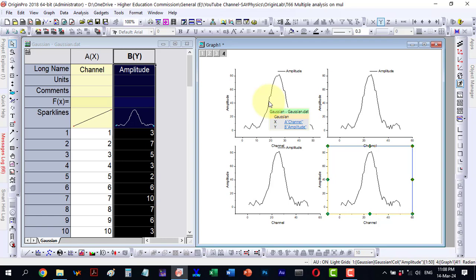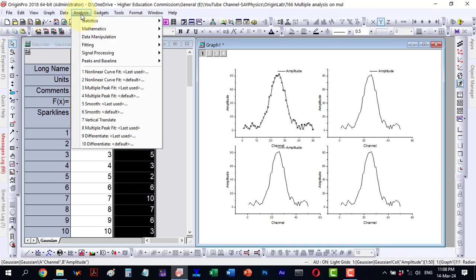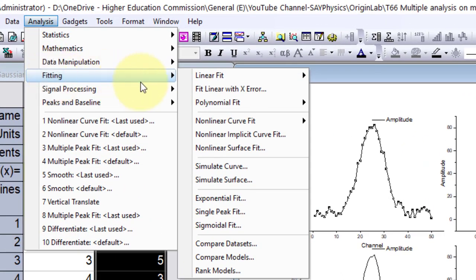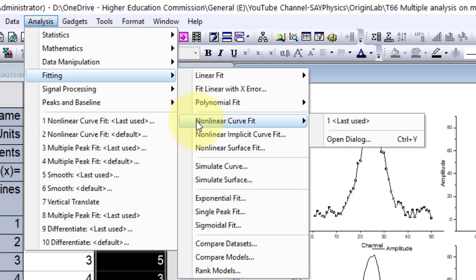Let's begin by selecting this data. Then navigating to the analysis table, I proceed to fitting. Under fitting, I opt for the non-linear curve fit and open the dialog.